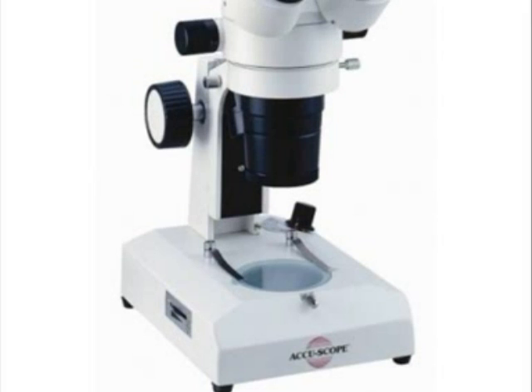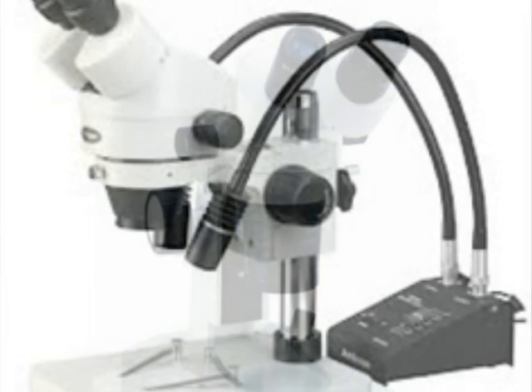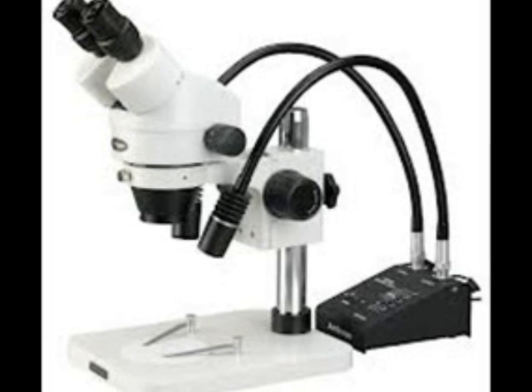For all forensic applications by which the stereomicroscope can be applied, the microscope is an efficient tool that will enhance the surface view of a sample. The stereomicroscope is a relatively simple microscope that will allow for easy manipulation of a sample with a clear 3D visualization.